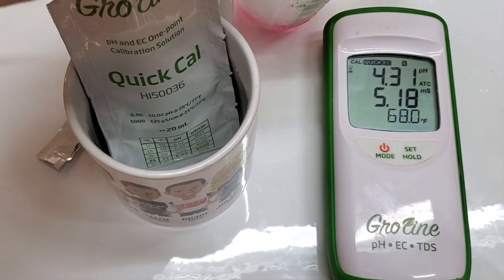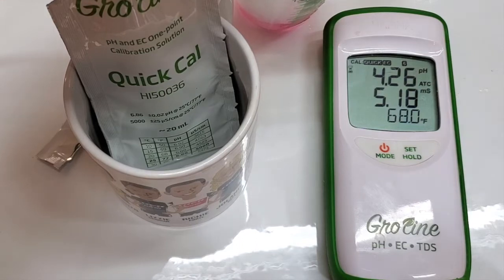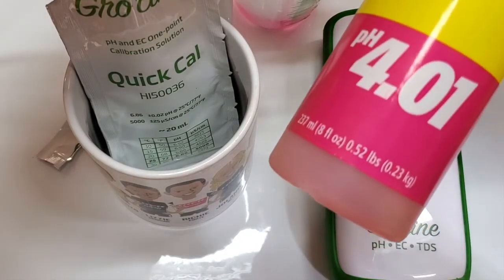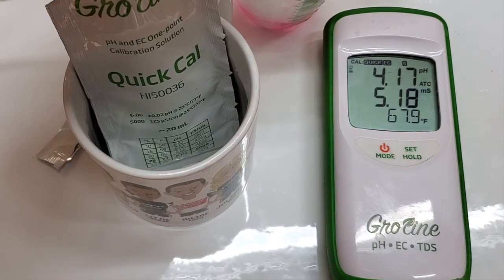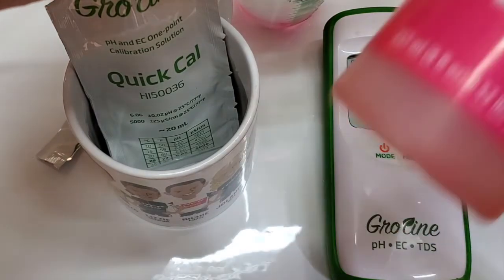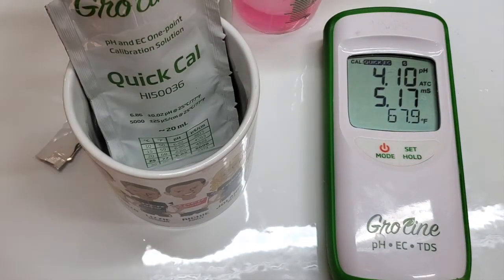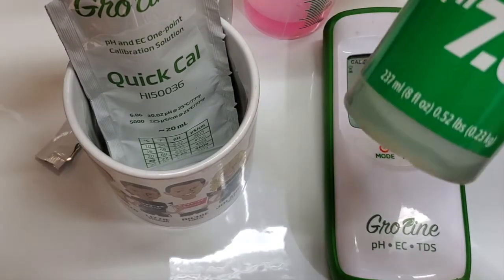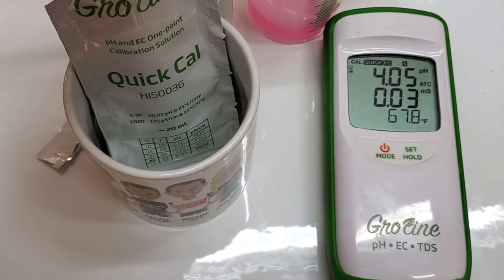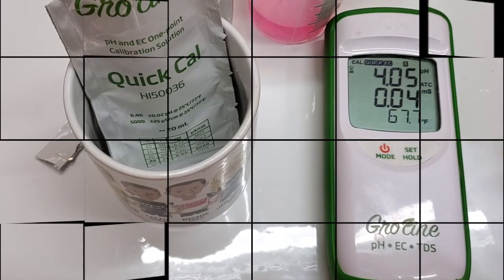Technically this calibration should be more accurate than this really old 4.01 solution. This solution is so old that it's actually measuring over — it's drifted up a little bit. Once it gets there, it'll show 4.1 instead of 4.01, so it's off by a tenth of a point because this solution is so old. So the quick cal for the win — it makes it a lot easier. But it's also good to know that if all you've got is some 7 and 4, or even just some 7 on hand, you can do a standard calibration. That's the quick cal solution.